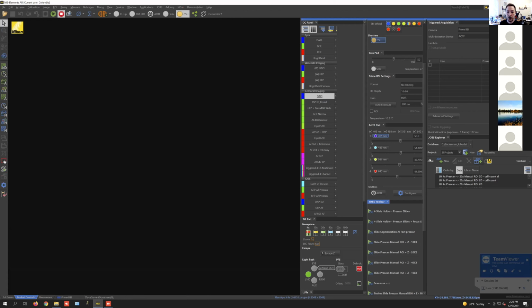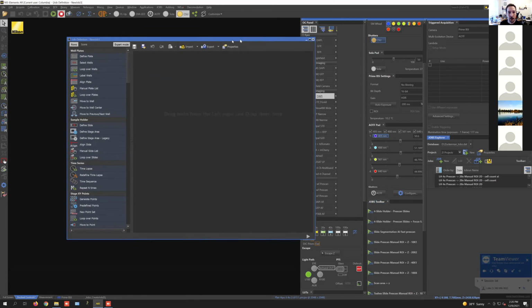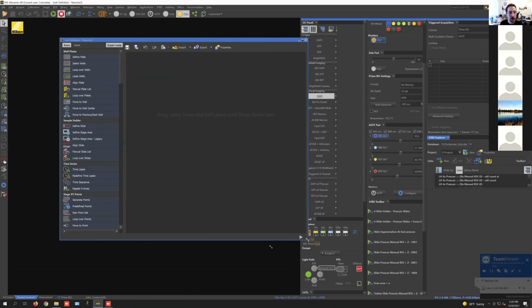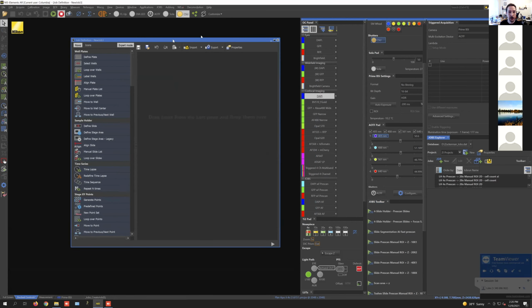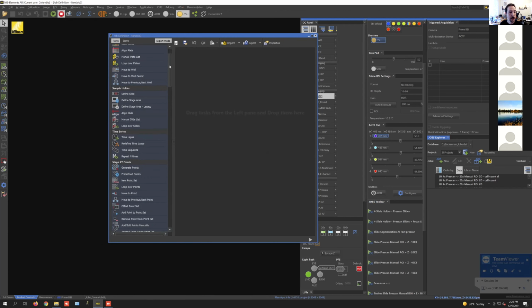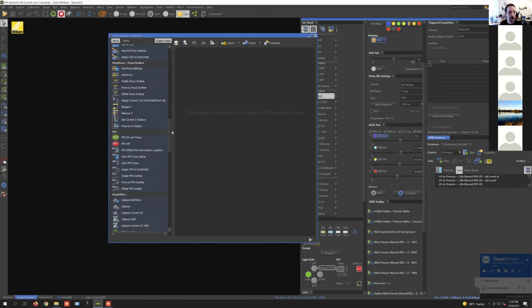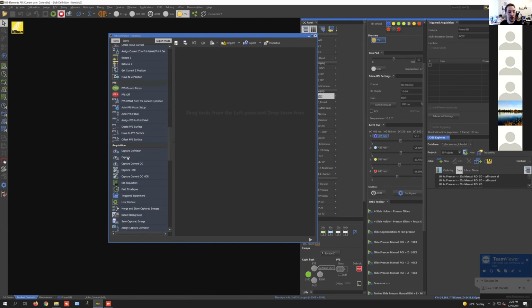So we can do this down on the bottom right corner, we have this Jobs Explorer. And I can create a new job just by clicking here. And just shout out if you can't see the text clearly or anything like that. So the first thing that we want to do is tell it, okay, I want to pre-scan this tissue section like we were talking about before. And so in here, we can go down to our acquisition. So right down here in acquisition, we can set up a capture definition.